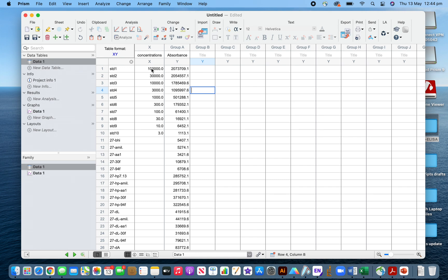Your standard concentrations will be on the x-value, and your absorbance of the standards as well as the samples will be in the y-value. You can label the samples anyway by your preferred method.